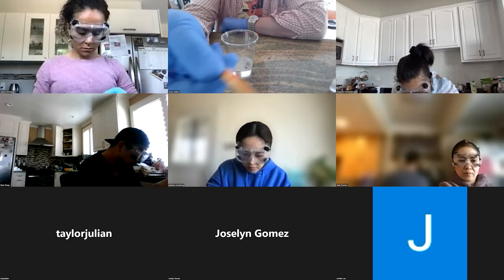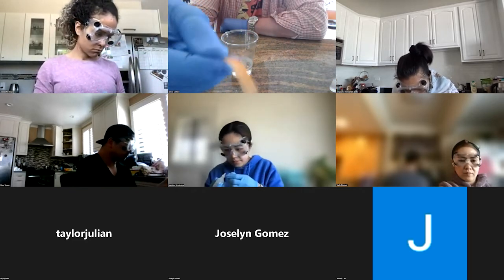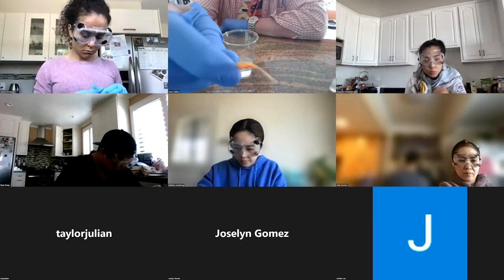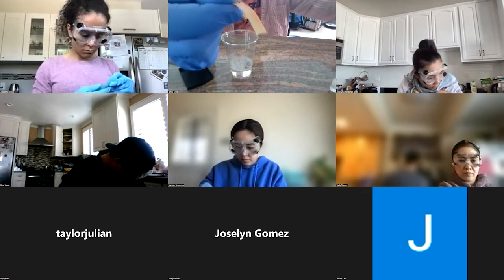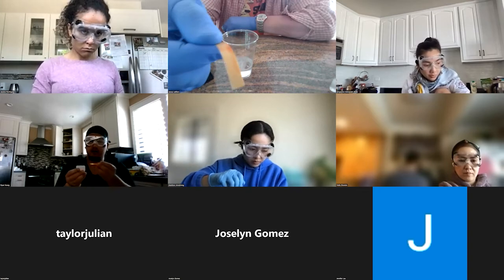So you can see that with my soap, at least, the color really hasn't changed at all. Maybe it's even a tad lighter. And that could be because the soap I used had grapefruit in it. Grapefruit is acidic.